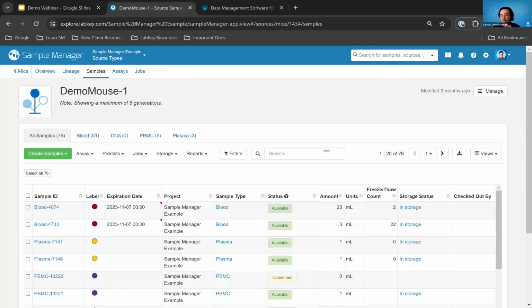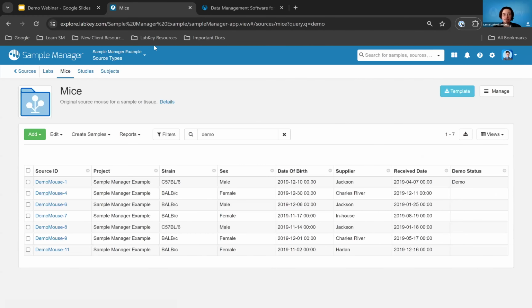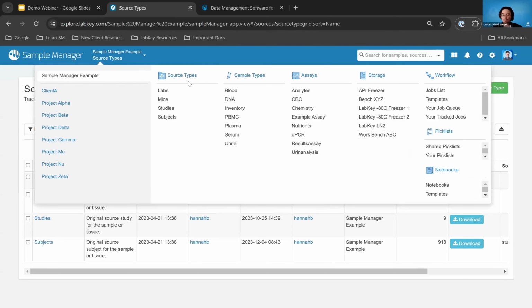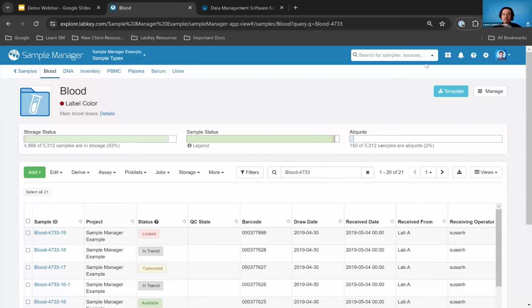And it just looks like we have a question here. Do you provide hardware for label printing, creating barcodes, and scanners for barcodes? We don't provide the hardware, but our system can definitely work with a bunch of different printers, labels, and scanners. We actually partner with a third-party service called BarTender, and they can help create those labels. So that's a great question. And if your samples are already pre-labeled, we can work with that as well. So you can easily scan your samples in.